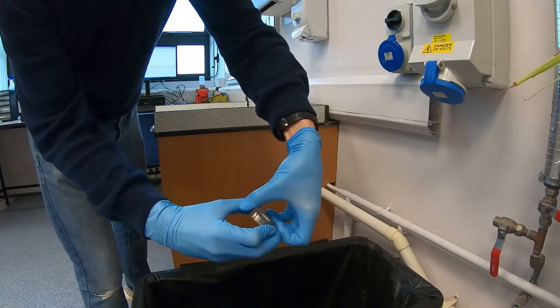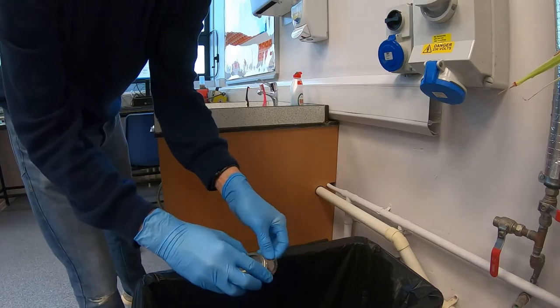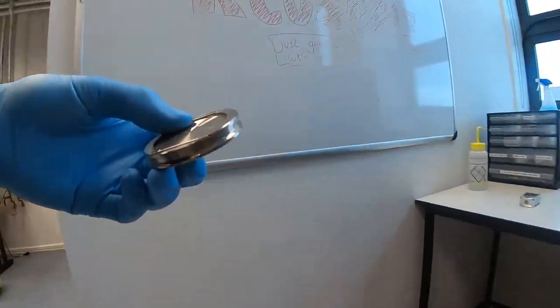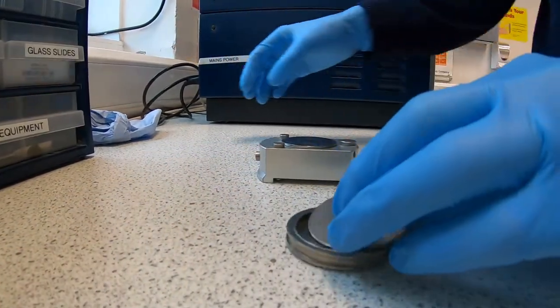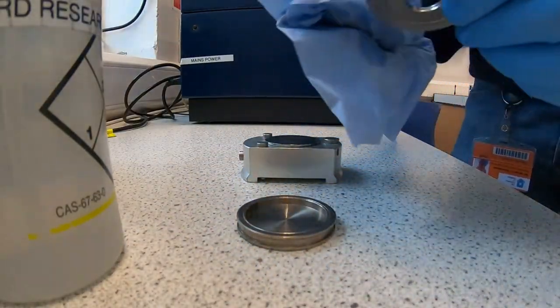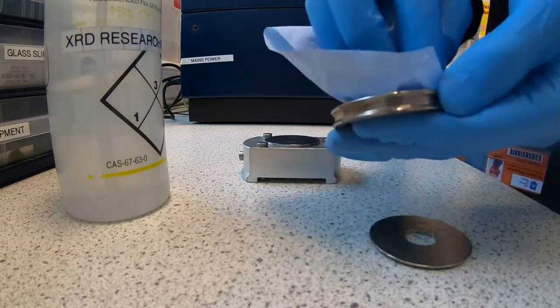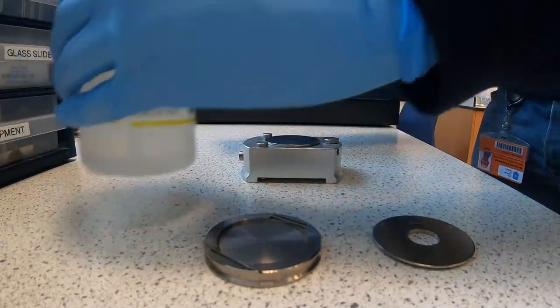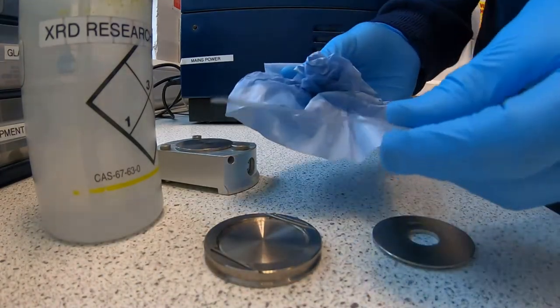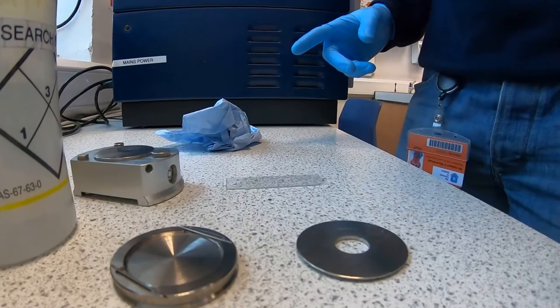It's really important that after you put it in the bin you clean it out. So I'll show you how to do that. It just pops off. The sample should just fall out. Do a good tap and it should hopefully come out of all the rings. Now I'm going to go back over to the place where we've made our samples. Put some isopropanol on here, give them a good wiping off of all the items. It's really important to use isopropanol and not water because these bits will rust. This is our glass slide that we used, clean that off as well. So now we put all these back in here and then we're all finished.